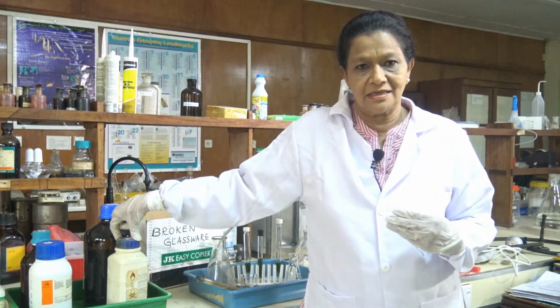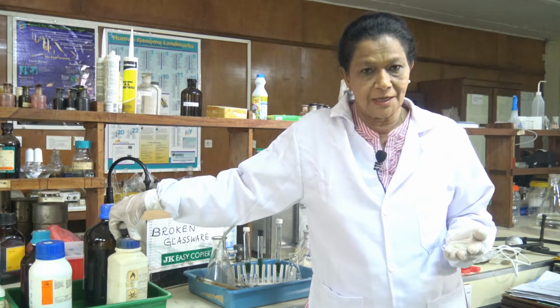So, especially when we work with these chemicals, we need to wear personal protective clothing. If these enter into the body by accident, you may cause health effects like vomiting, poisoning.